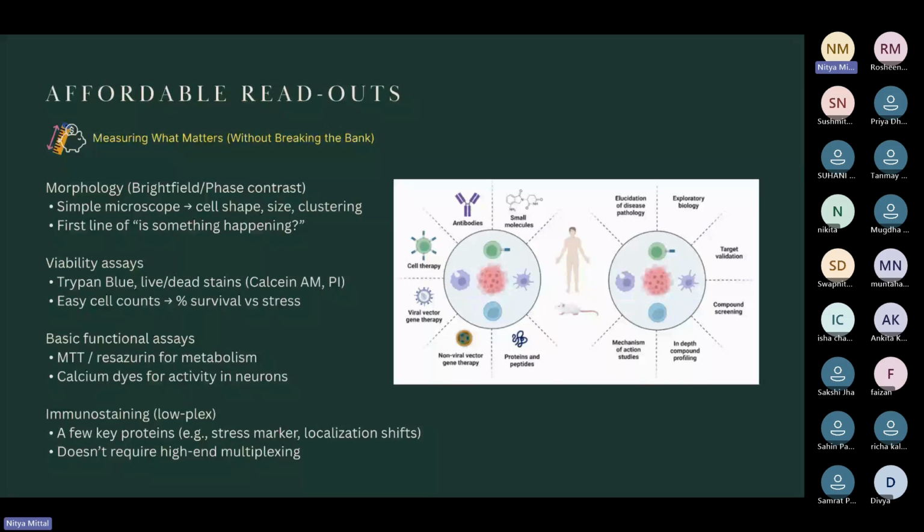You don't even have to develop the whole assays. You can see there are some papers out there that will tell you if you're doing this correctly or not, depending on what your research question's goal is. I know there is MTT for the metabolism assays, and this is usually done for cancer cells, if I'm not wrong. When you do a drug treatment on cancer cells, you can test how the cells are performing using the MTT assay to check the metabolic activity in the cells.